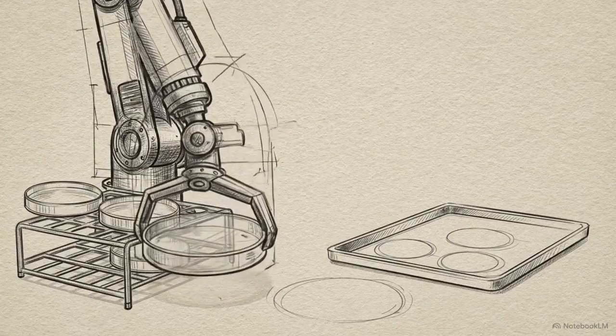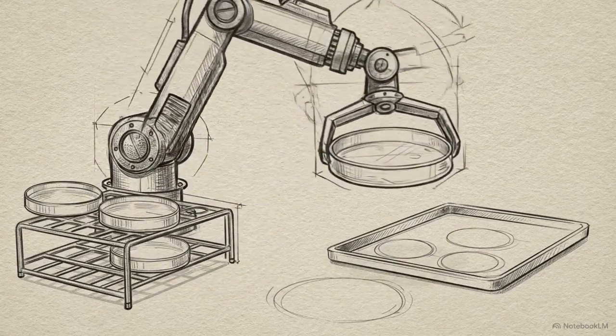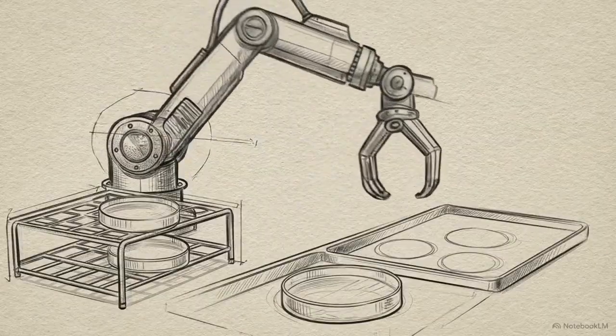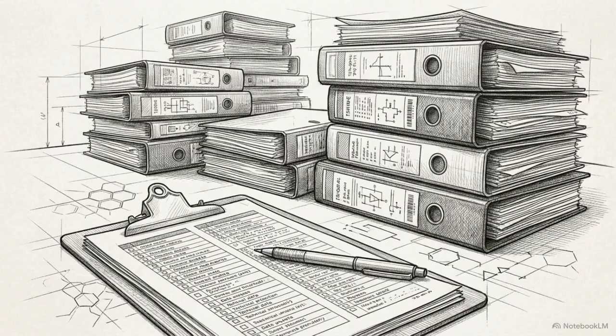When the pharmaceutical industry discusses digital transformation, the conversation usually defaults to hardware. Lab managers are often told they need a $250,000 automated plate reader or a fully robotic incubator to modernize their microbiology quality control, or QC, programs.